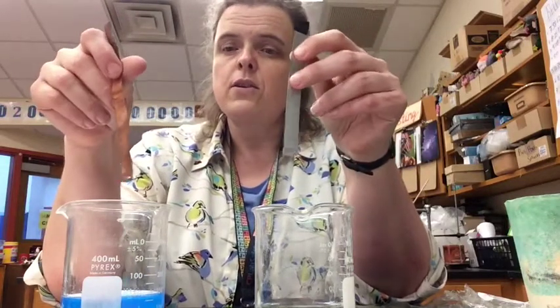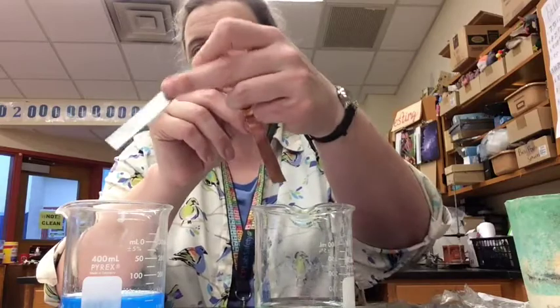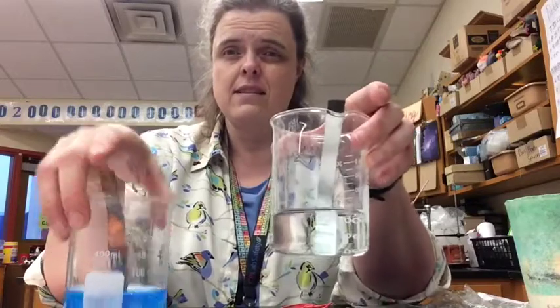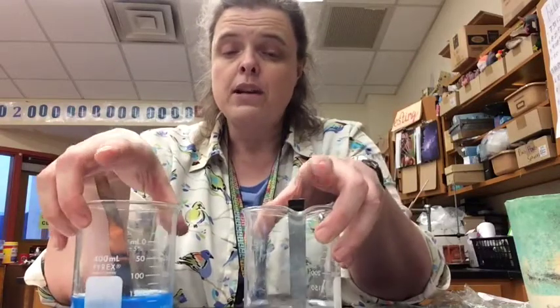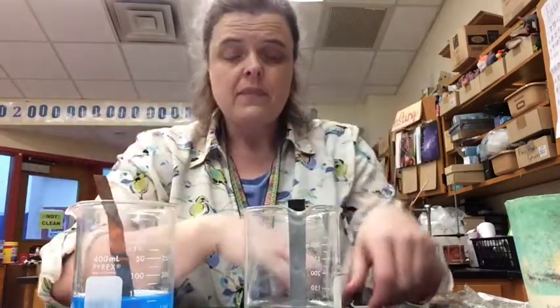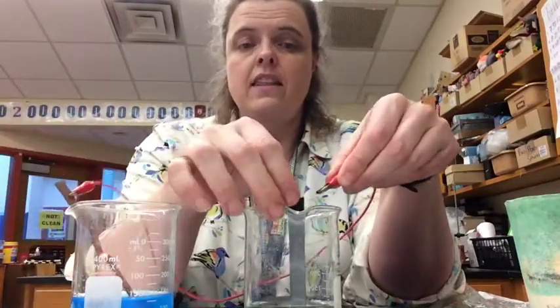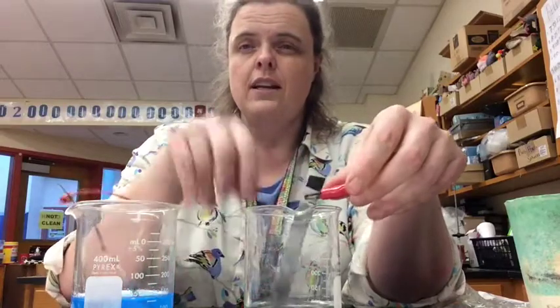Now when I put them in here, notice I'm not putting them this way. If I put them in here, then this one would react. I want to spread out the reaction. So I'm going to put them in here, so they're not going to react. This is just zinc and zinc ions and copper ions. And what I need to do is connect these. If I give a way for the electrons to flow, then they will flow. Give it a wire for it.